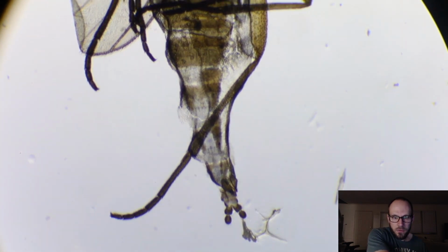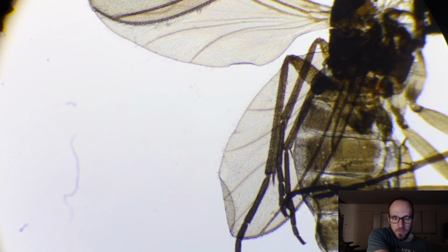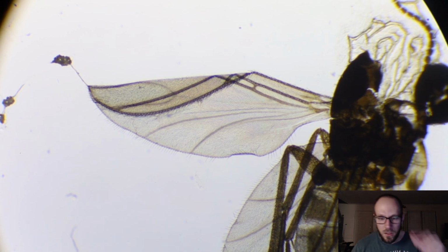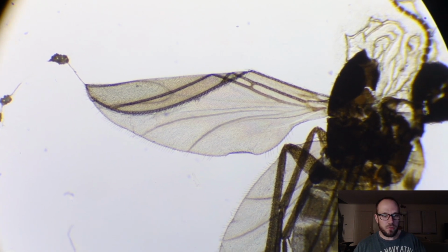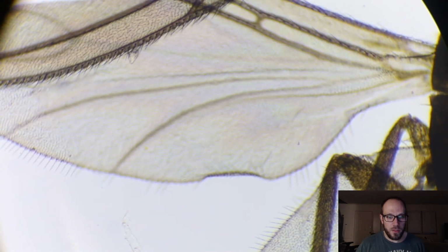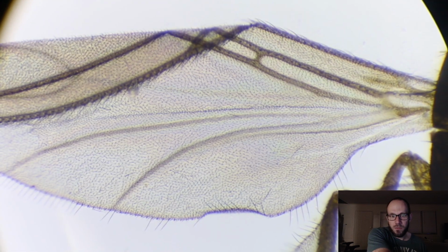Yeah, he had a sack of crap here, but you could see, on his wings, the individual cells as well as hairs. Now, this is the lowest magnification. This is 40x. Let's jump up to 100. Bam. So, wait for the camera to process this a little bit, and here we are. You can see tiny, tiny little hairs on this guy's wings. So, really cool to look at.